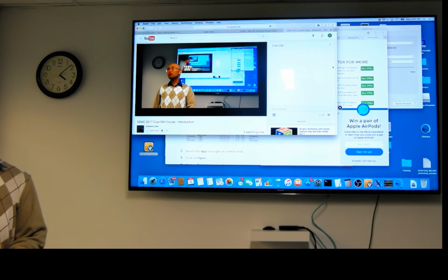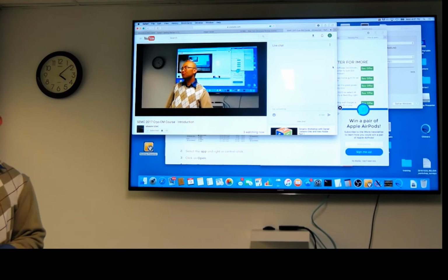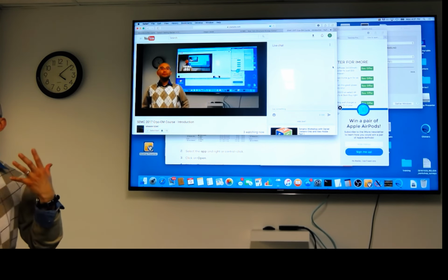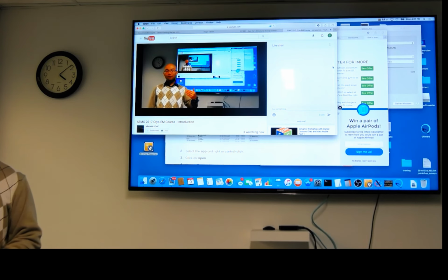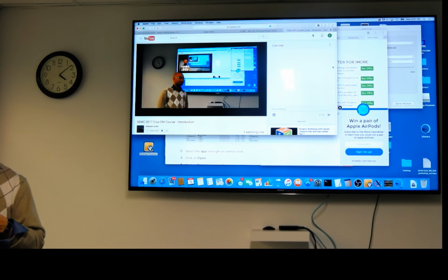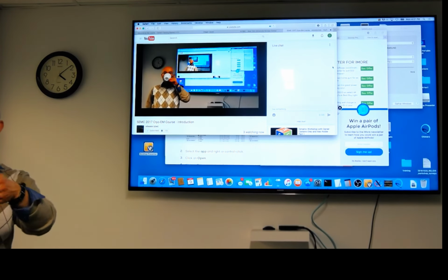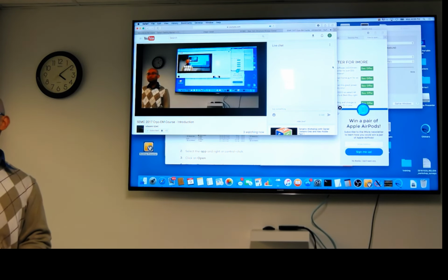Appium is tomorrow. That will be primarily if you're collecting data at a microscope here, you'll be getting micrographs. And then what do you do with those micrographs? So that's Part 1. Part 2 is on reconstruction, the further along single particle workflow, where you want to make a 3D reconstruction. Part 3 is, let's say you collected a tilt series, how do you process that data? So tomorrow is just Part 1.